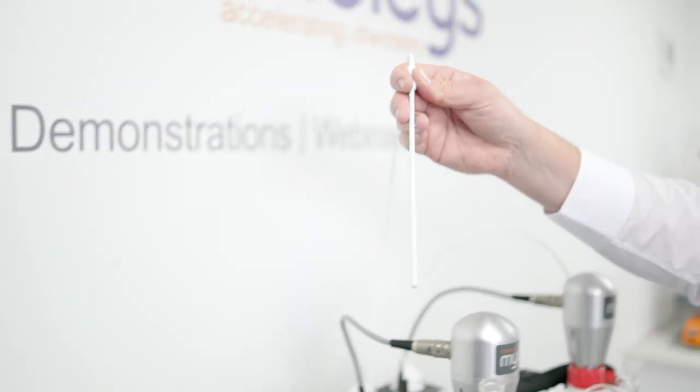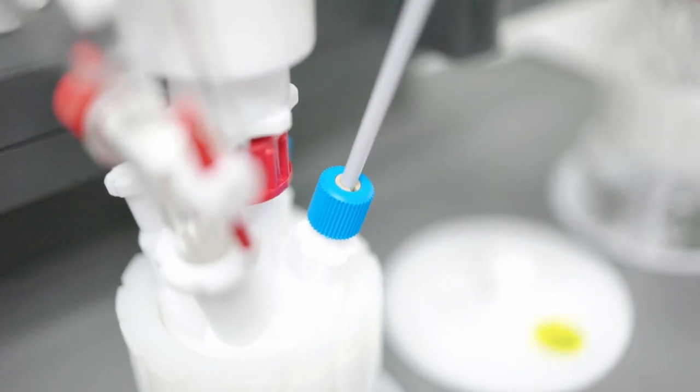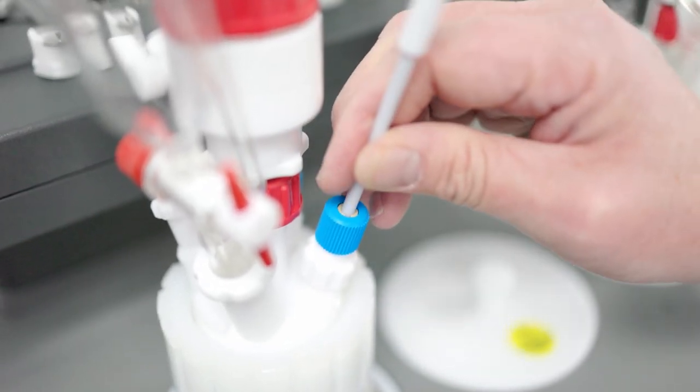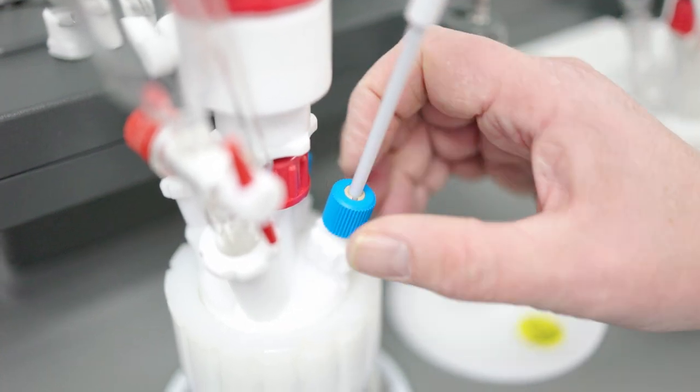The probe now has a 4.6mm outside diameter, and therefore we have new adapters for the B10, the B14, and the 3.8 MPT adapters.